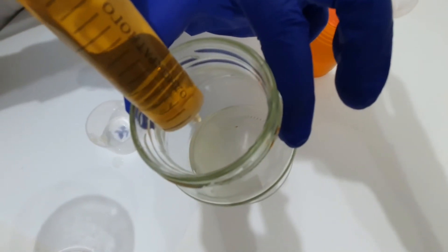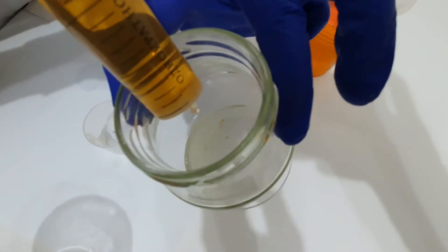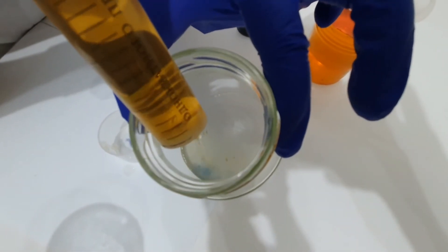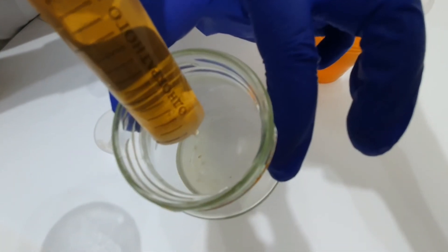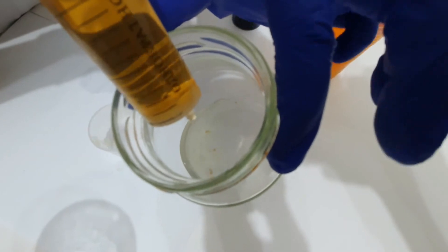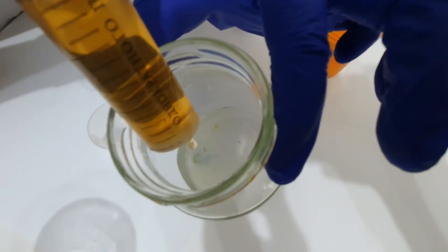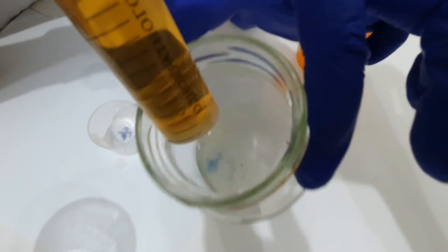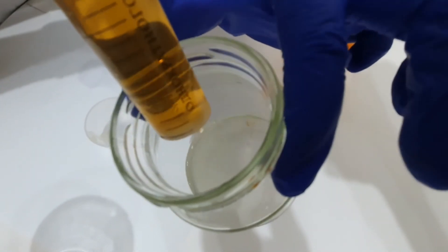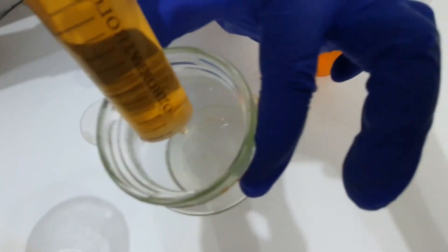You can see that the color starts to change because starch reacts with iodine and a very specific blue color appears and disappears, because the amount of iodine is not so large. The iodine is reacting with the vitamin C.